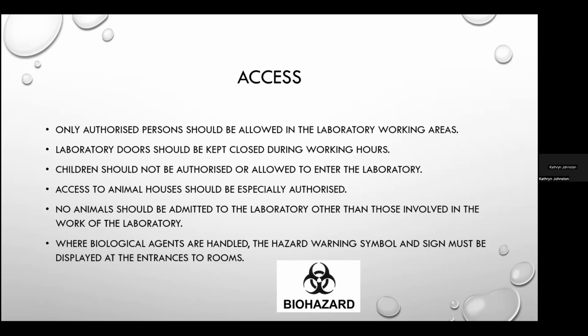The laboratory doors should be kept closed during working hours to deter unauthorized entry, and it's prudent to keep the doors locked when the laboratory is closed. Children should not be authorized or allowed to enter the laboratory. And where biological agents are handled, the hazard warning symbol must be displayed at the entrance of the rooms. And this is the biohazard label that we should be seeing.